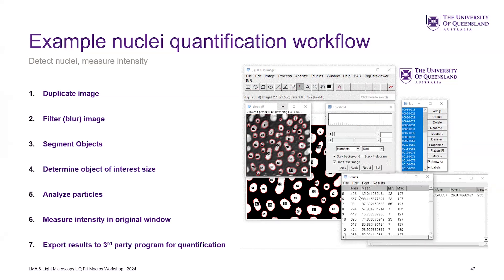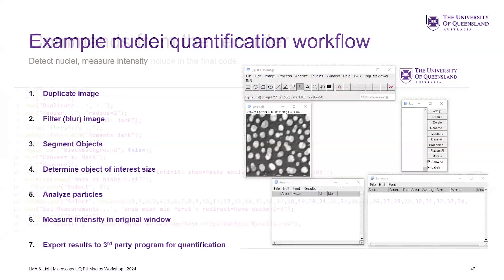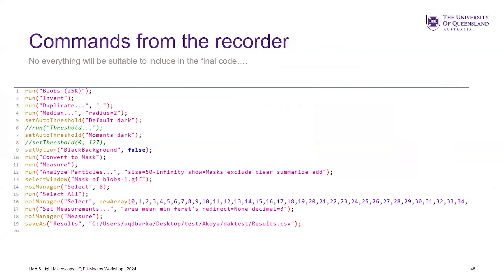Hypothetically, let's pretend these are nuclei and I need to find the nuclei and then go and measure them in some other channel. I get this big results table and I could take that results table to Excel or continue down the track. So that's kind of what the commands would look like.